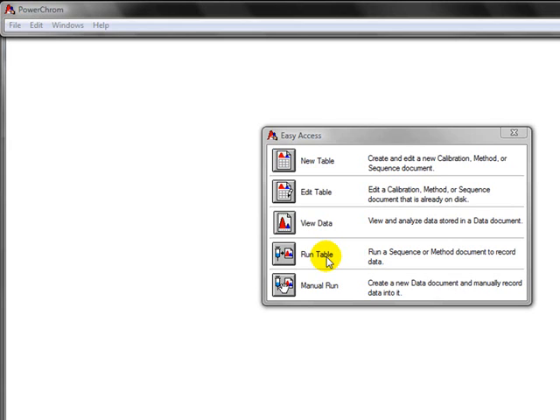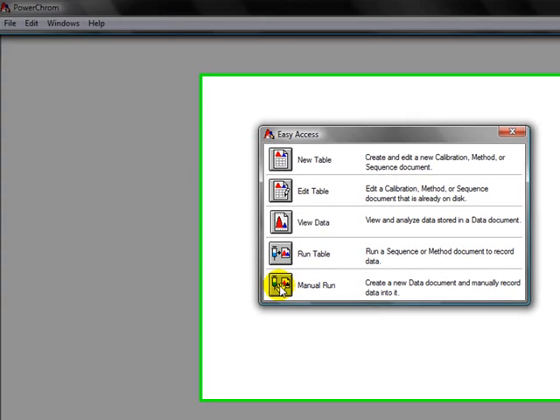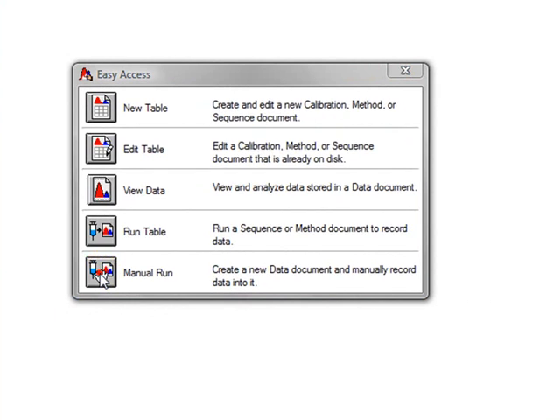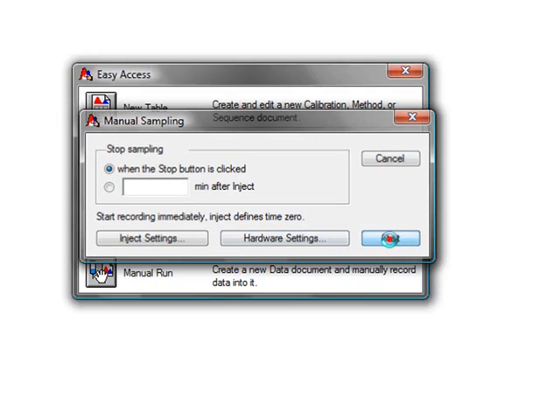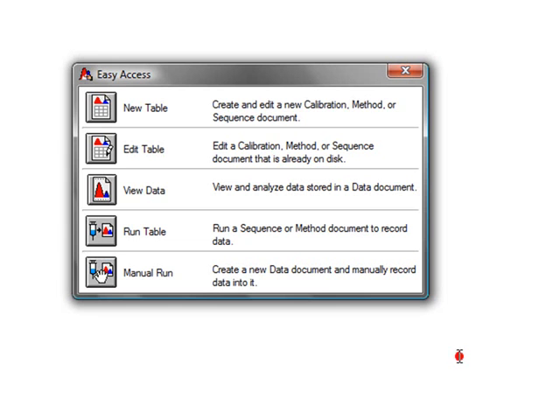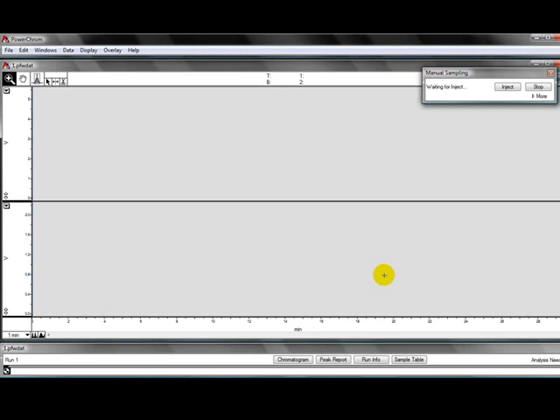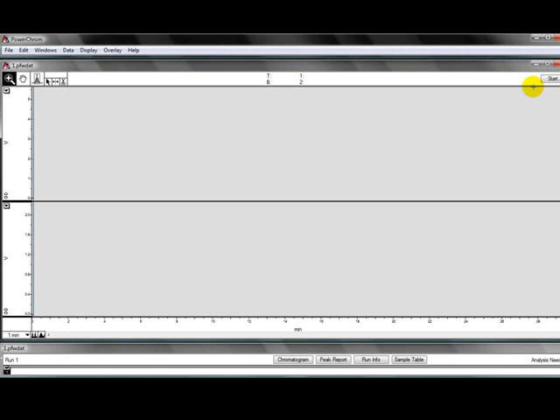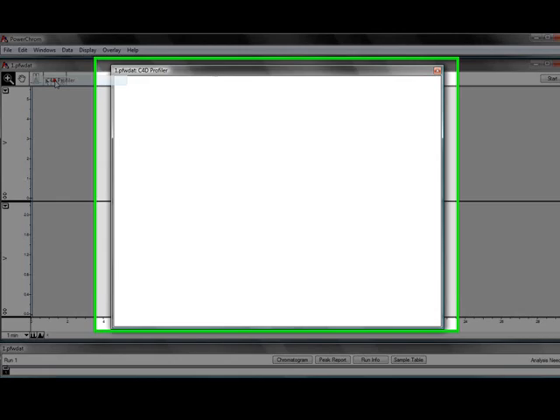Then open the PowerChrome software, click on manual run, you should click start and give a file name. You can click on stop and in the menu windows choose C4D profiler.